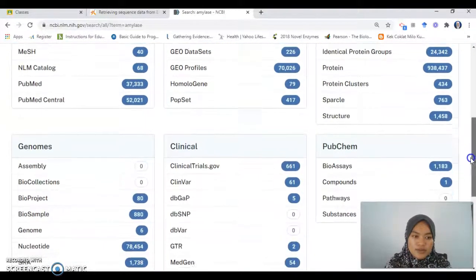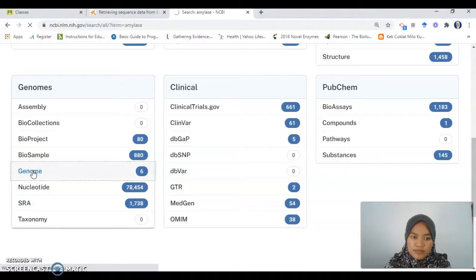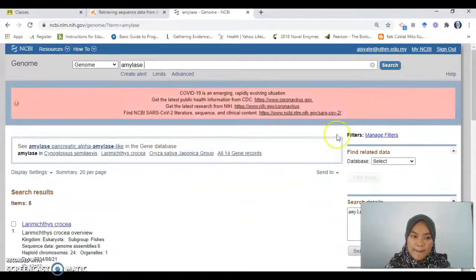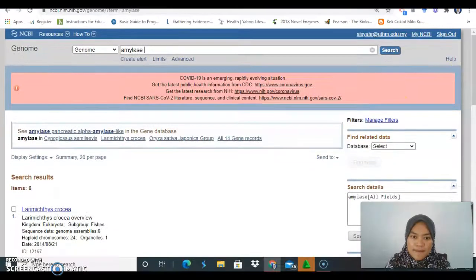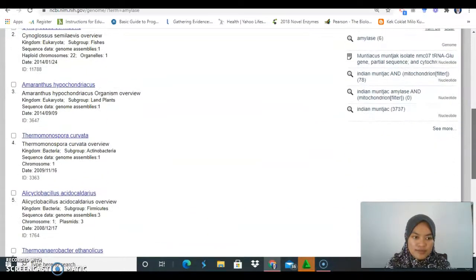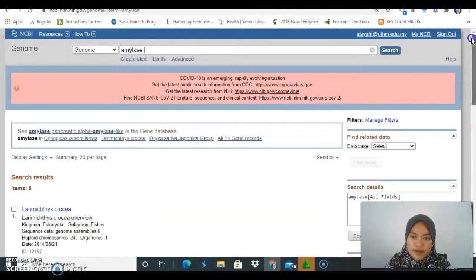So let's go to genome and see what this is. Is it what I want? Okay, this is from the genome.